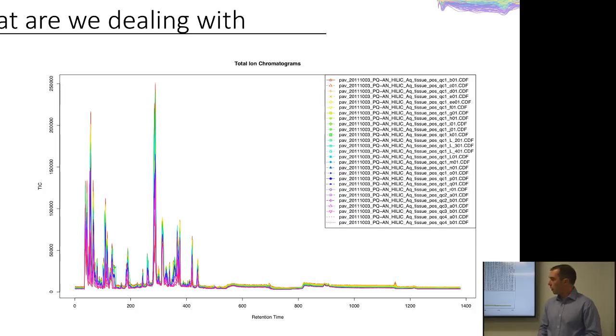And you can see that our peaks are very nice and thin. We're getting somewhere between 2 seconds on the small side to about 30 seconds on the longer side retention time peaks here. And probably that first part of that chromatogram is very, very busy. There's a lot of information there. And that latter part of that chromatogram has less data in it. So we probably could have altered the chromatogram. This is one of the nice things I like about doing those TIC overlays, is that it very quickly tells you this type of information, and you can see what to expect from my experiment.